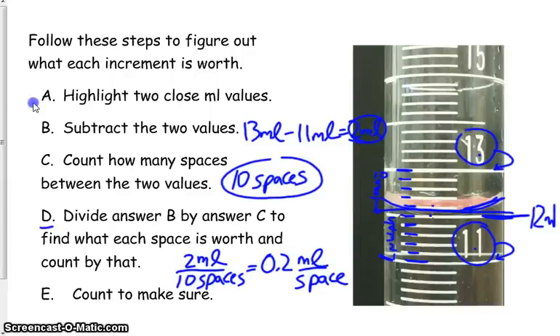Again, it's between these two lines here. So we already know that we have 12 milliliters here. And we know this is 12.2 right there. These two lines. So I'm going to estimate that to be at 12.1 milliliters for our reading.